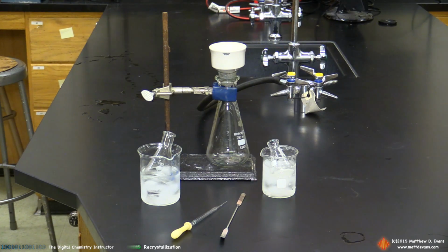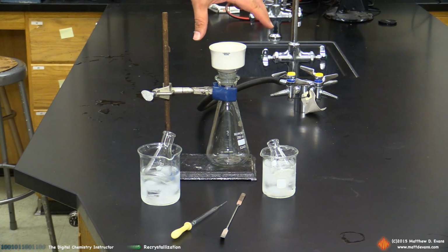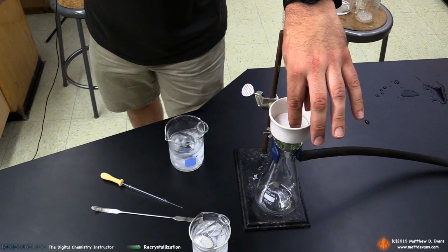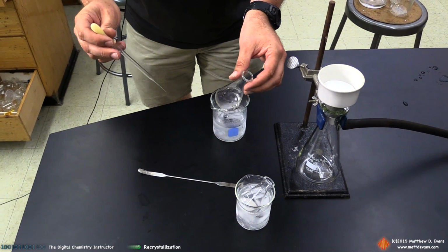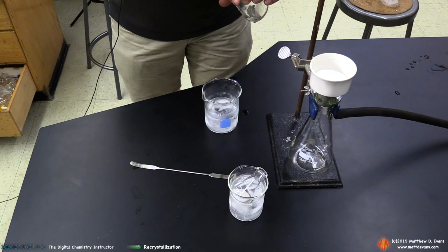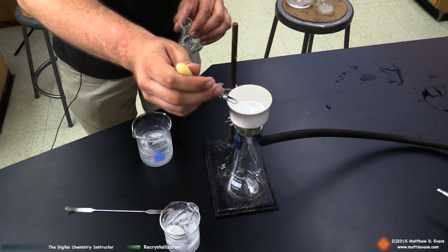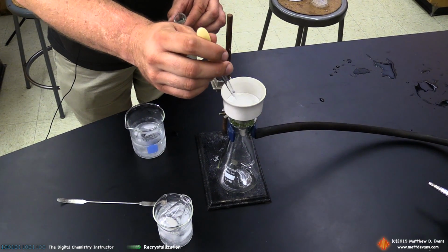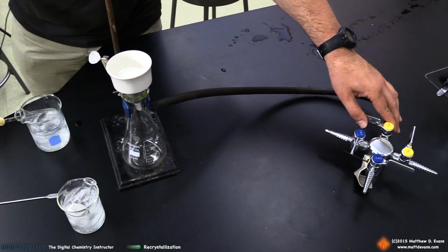Okay, we've been letting our compound sit in an ice bath for about 5 minutes now, and before I can pour it onto the Buchner funnel, I put a little piece of paper that just fits this Buchner funnel, and you can't see it right now more than likely, but there's always some filter paper available in the cart. It fits right in there. Before I can pour my stuff onto it, though, it's really important that we wet the filter paper. So take that cold solvent that we chilled down previously. I'm going to put just enough on there just to rinse the paper, get it nice and wet. And then I'm going to turn on the vacuum to hold that filter paper in place.